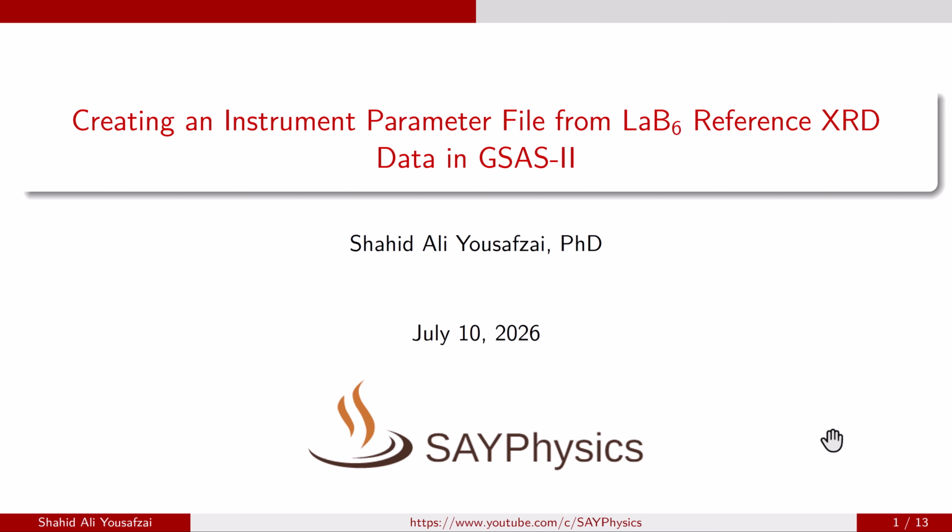In this tutorial, we will learn how to create an instrument parameter file from a lanthanum hexaboride, or LaB6, reference XRD pattern using GSAS-II. The goal is to build a practical understanding of how a reference material is used to describe the peak shape behavior of an X-ray diffractometer.